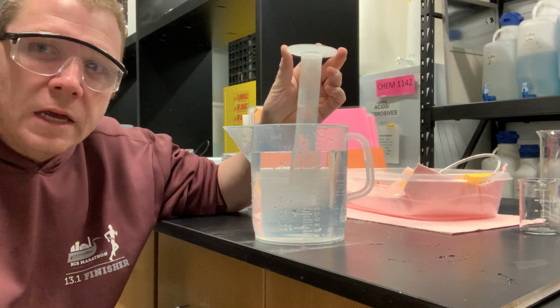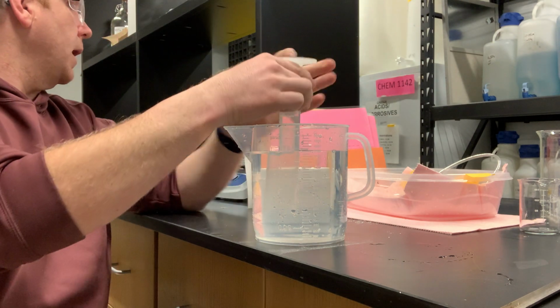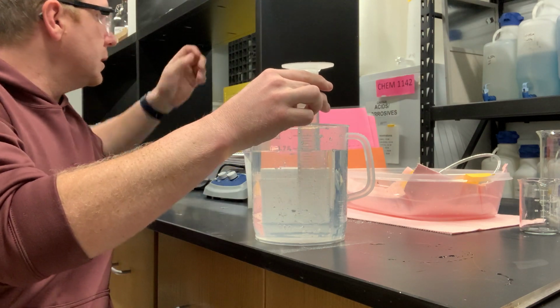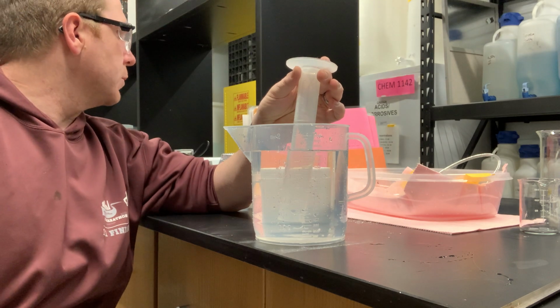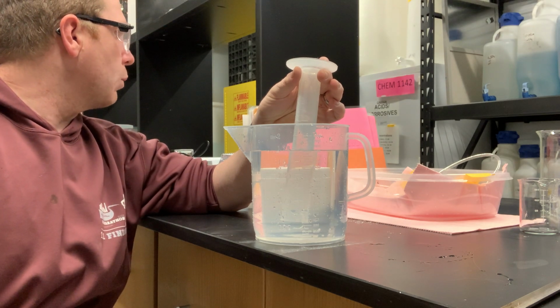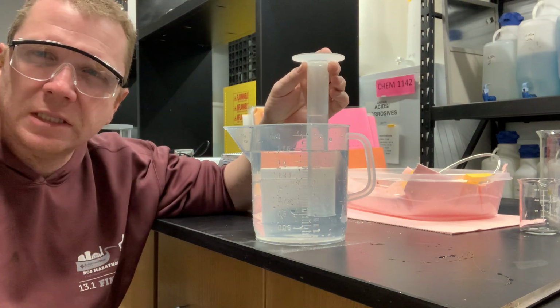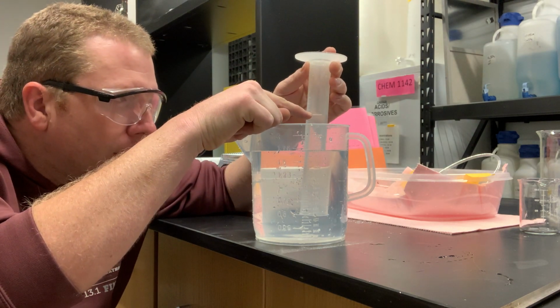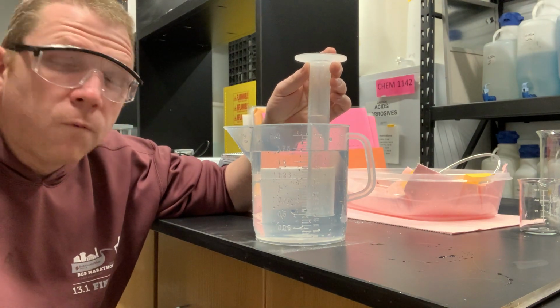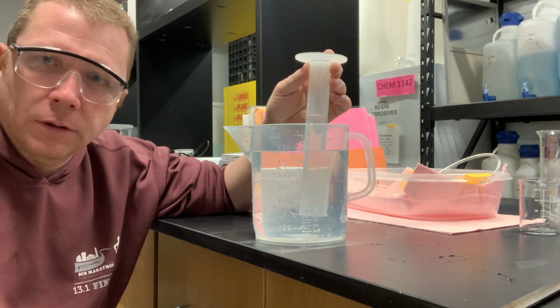Now, whenever I invert my graduated cylinder, what I'm going to do on page number 163, which is incorrectly labeled part 1 of my procedure, is record my initial graduated cylinder volume. This might seem a little bit odd, but I'm reading from the bottom, and I see that I have 44 milliliters of gas already in this grad cylinder.